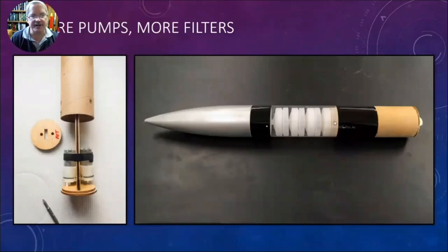Lots of variations here. The other thing that will at least fit but requires a bit more complex tubing manifold is we can stick 8 of the smaller 25 millimeter filter holders in here. So this has the potential to doing much more complex filtration and sampling.